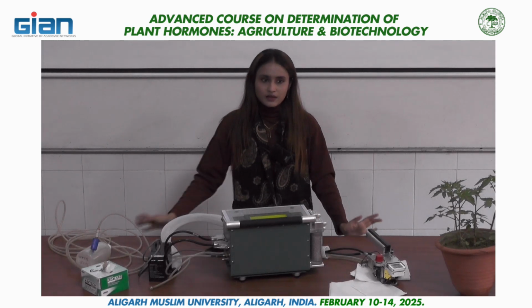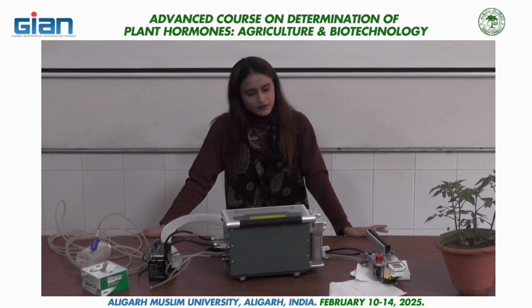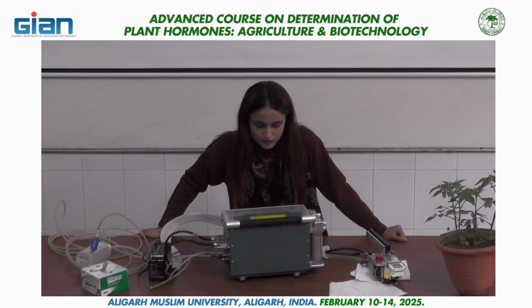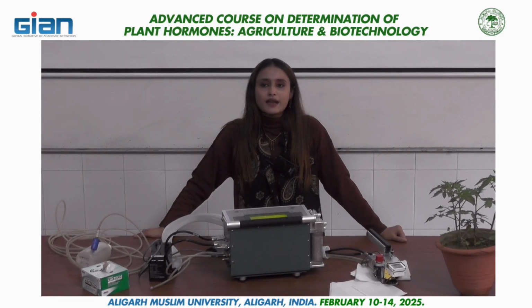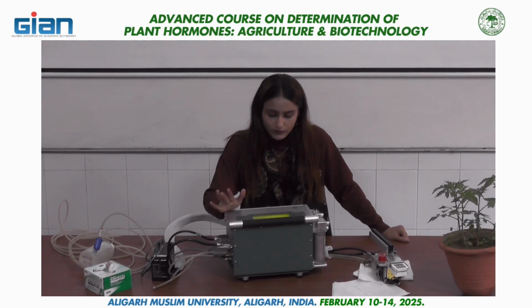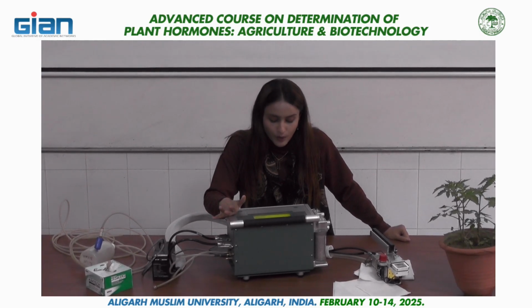Now it is stabilizing itself. Fine. So we have to wait for a few seconds here also. Now readings are in positive. We have to wait for it to stabilize and become positive.